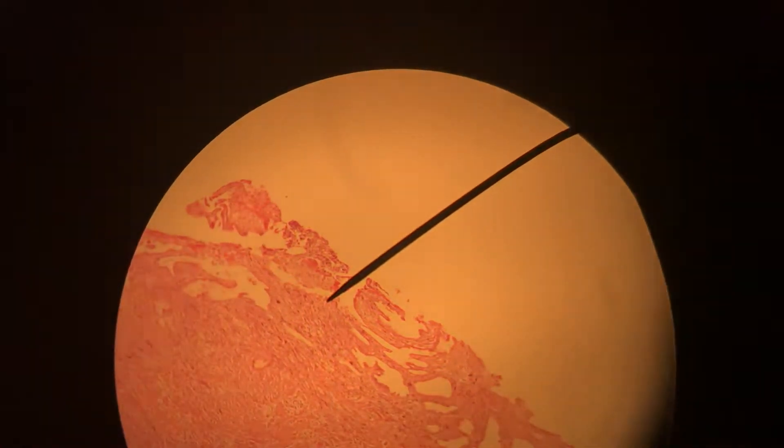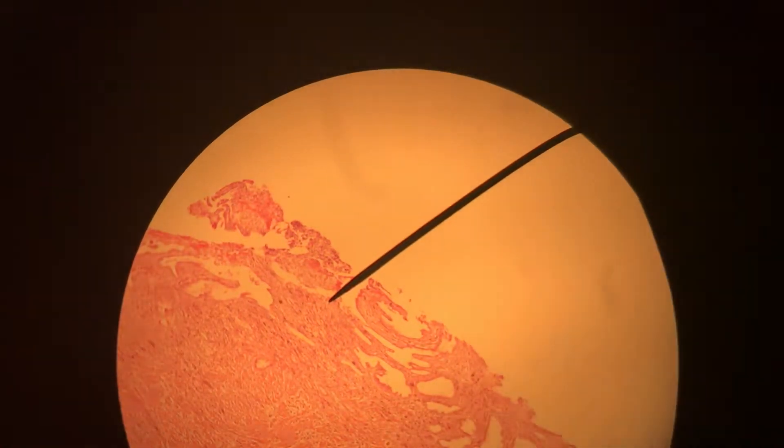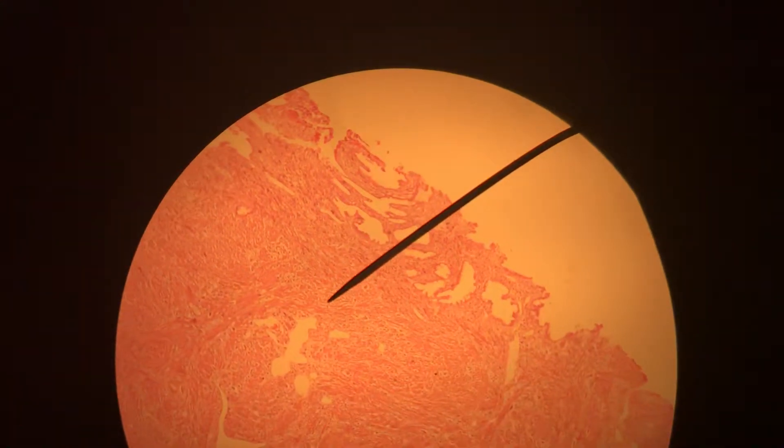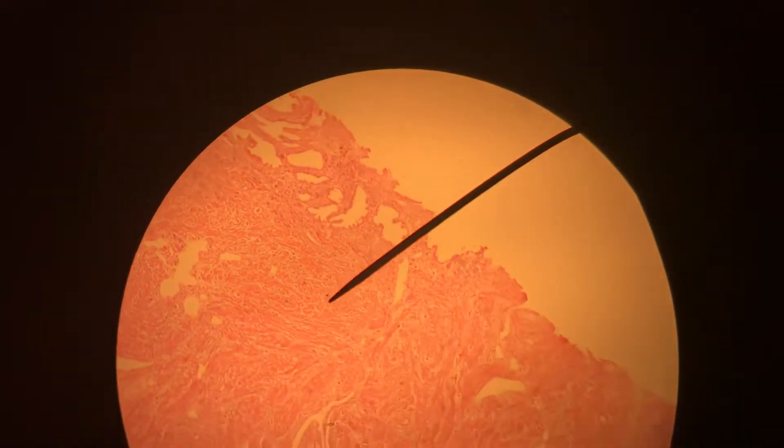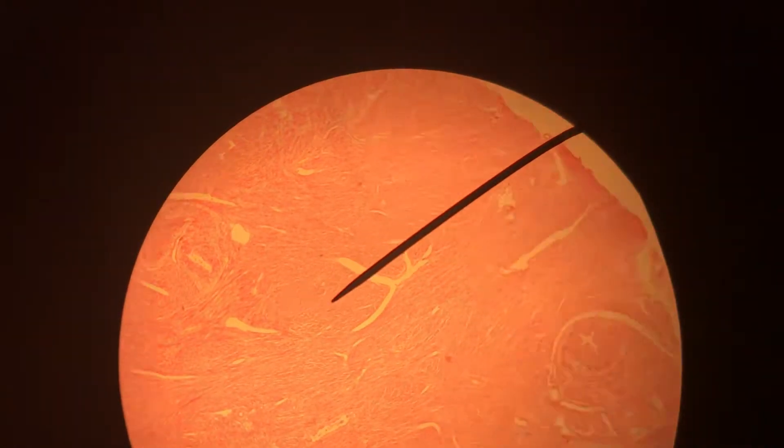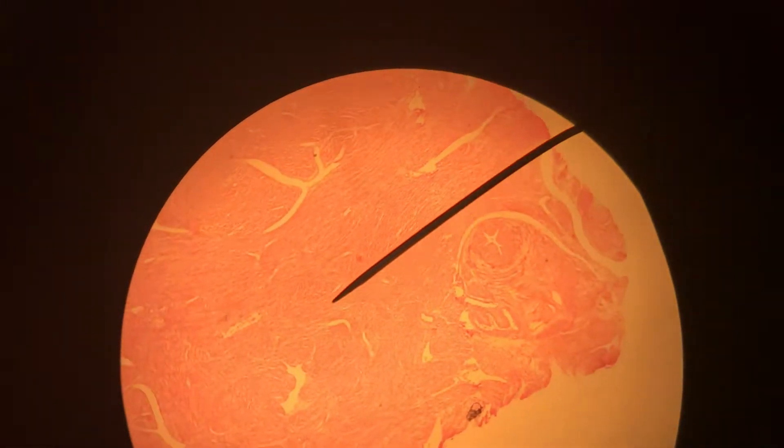So this is the slide for the uterus. I'm just going to show it around and you identify your structure, which is just the myometrium and the endometrium.